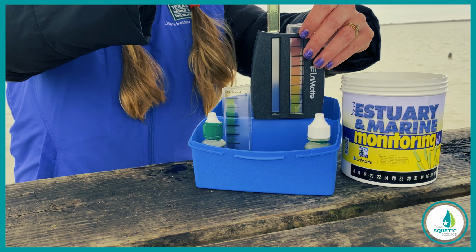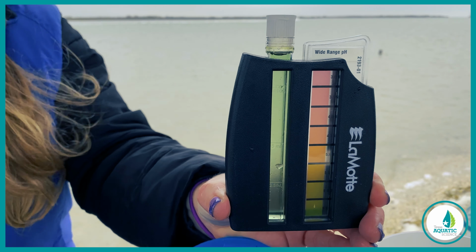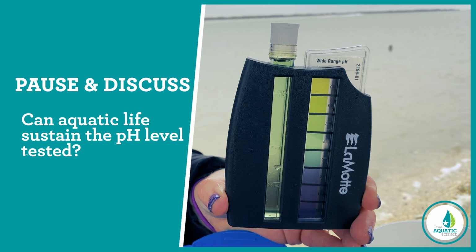Next, we'll compare the color of the sample to the pH color chart. Why don't you pause this video and take a moment to record the test result? And while you're at it, discuss if aquatic life can sustain the pH level tested.